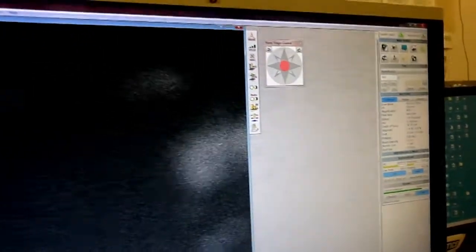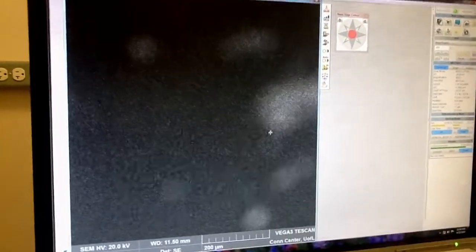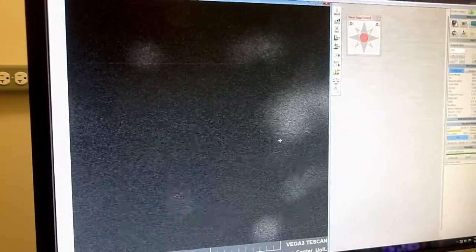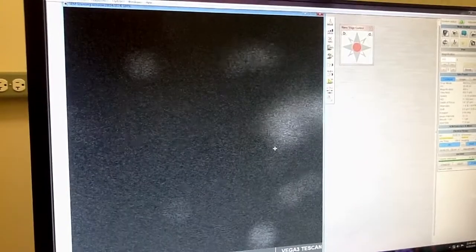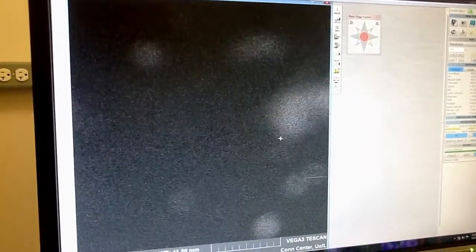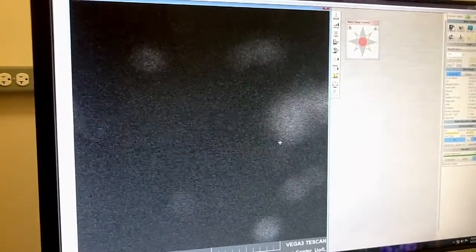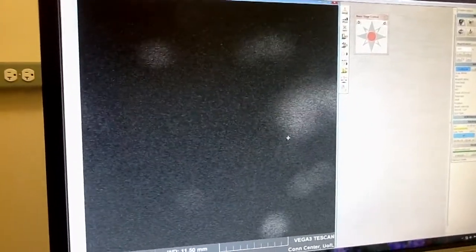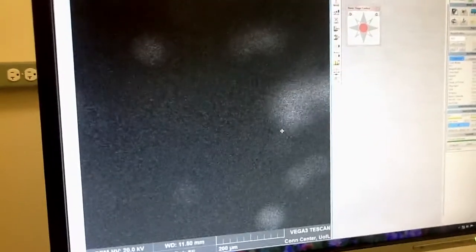You can see that the image is out of focus. This is because your sample is way too low — it's below 11.5 mm. So now you need to refocus mechanically by turning the knob and raising the stage manually.